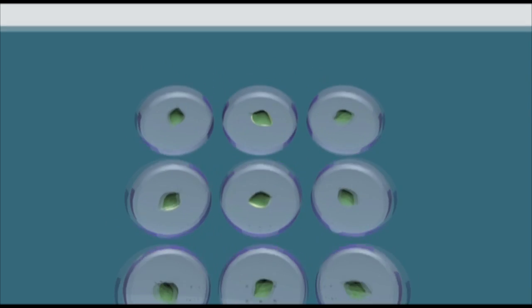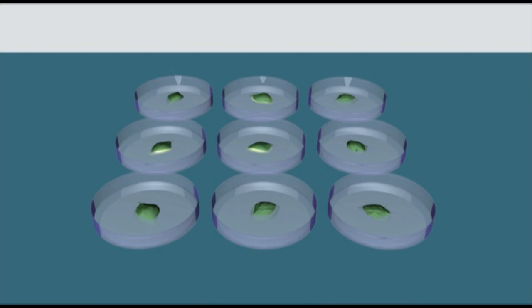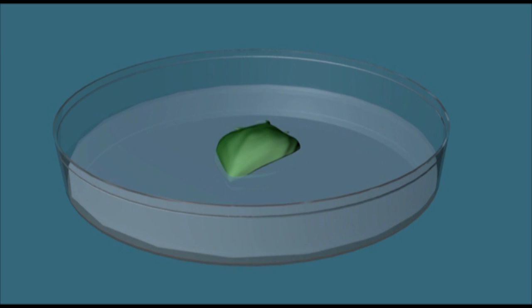Each plate here has one of three types of media that, depending on its combination of auxins and cytokinins, will produce different effects.